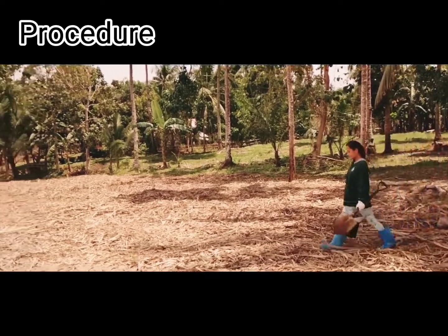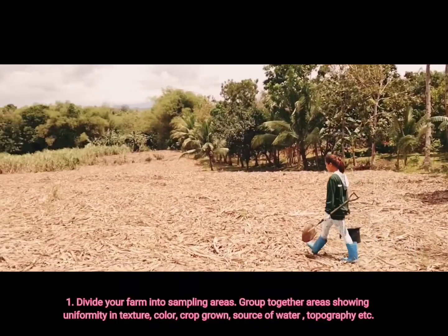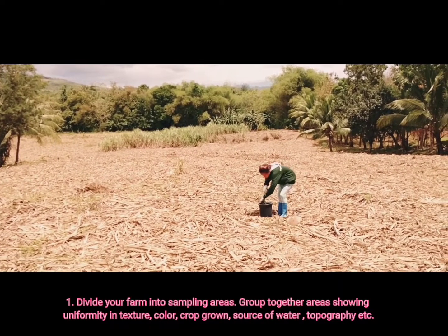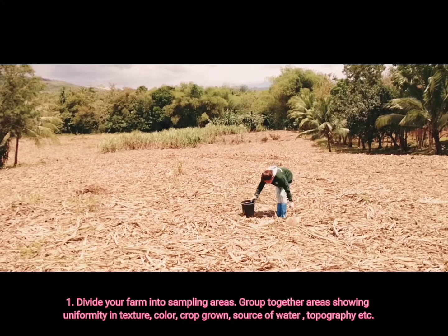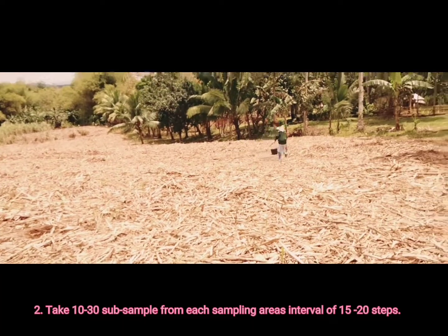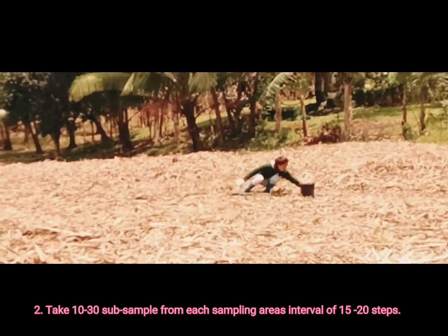So let's come now for the procedure. 1. Divide your farm into sampling areas. Group together areas showing uniformity in texture, color, crop grown, source of water, topography, etc. 2. Take 10 to 30 sub-samples from each sampling area at intervals of 15 to 20 steps.